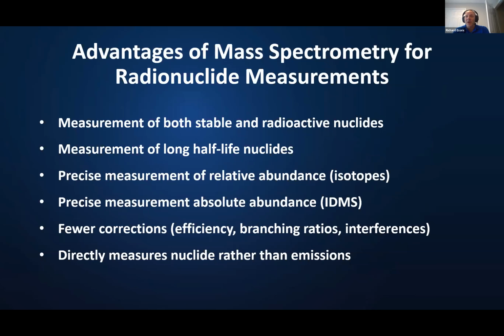Certainly for mass spectrometry, one of the things that is almost necessary for any kind of high precision measurement, specifically for isotope ratio mass spectrometry, is you want to have very clean samples to minimize interferences and also enhance your signal intensities. So the preparation for some types of mass spectrometry, particularly for thermal ionization mass spectrometry, can be quite extensive.